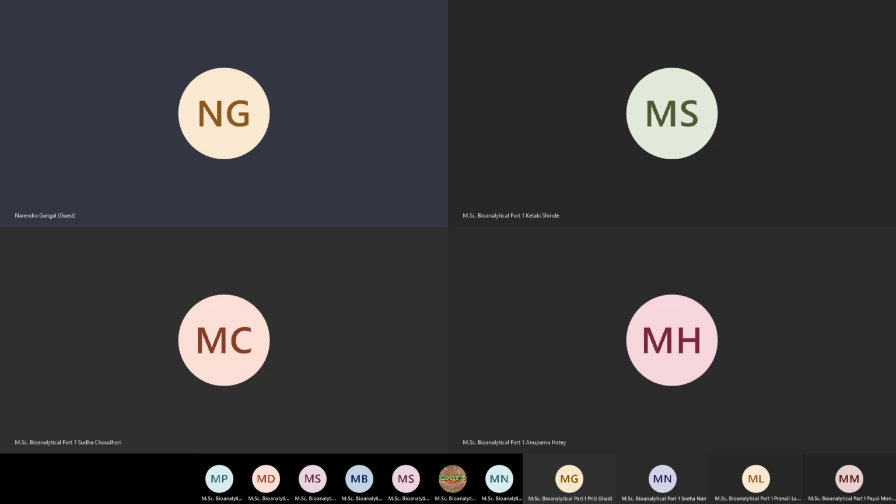So the technique which is typically used, again GC is an inlet system as we discussed. It is one of the parts of the mass spectrometer. The mass spectrometer is coupled with an inlet system, whereby the sample is introduced through that inlet system into the mass spectrometer. The next series of compounds are those which are not evaporable but can be dissolved. We discussed that if I can dissolve, I can resolve on LC, that is liquid chromatography.